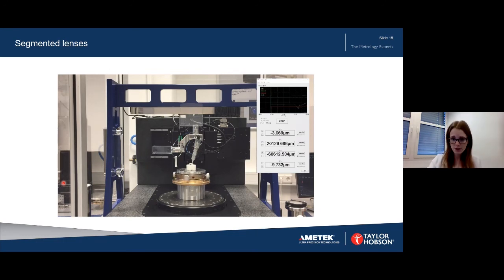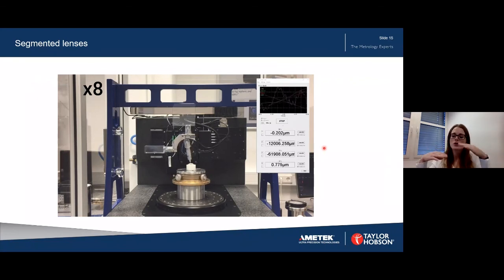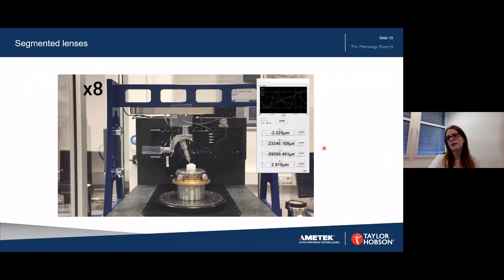Even when it's not on the surface, again, you will see it here in the signal of the object probe that's represented by the yellow line. While I'm on the surface doing a full rotation, this is a nice sine wave. When I'm going off the surface, you will see big steps and spikes, but we're always coming back to the original value because we are using multi-wavelengths interferometry.